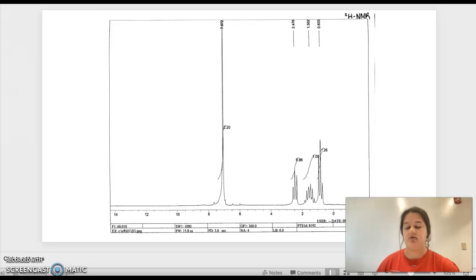You diluted your substance with chloroform D, like a 1-to-1 ratio, and then you put that test tube into the machine, and there were many steps and codes to get all of the information to show up on your graphs, like the proton signal, the numbers for the ppm, and then at the end you had to add all of the codes back to print out your spectrum.